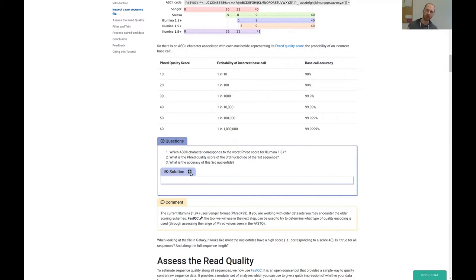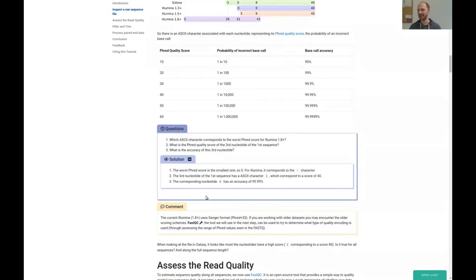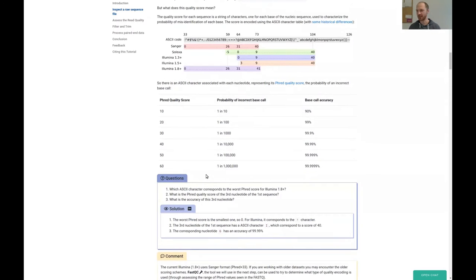Maybe stop the video now and try to answer these yourself. I'll continue. So the first question — in Illumina 1.8, the worst score is zero, corresponding to the exclamation mark. For the second question, what is the PHRED score quality of the third nucleotide of the first sequence?